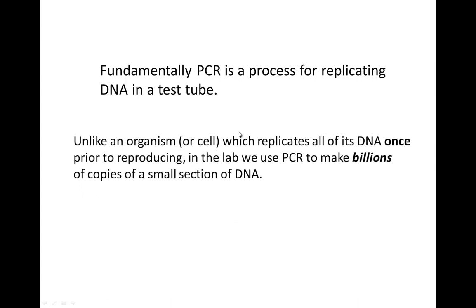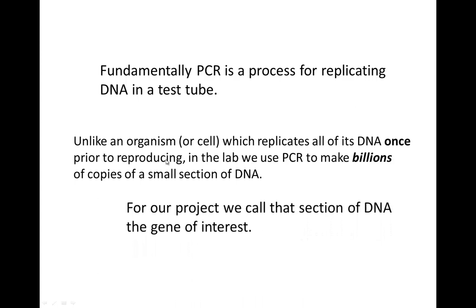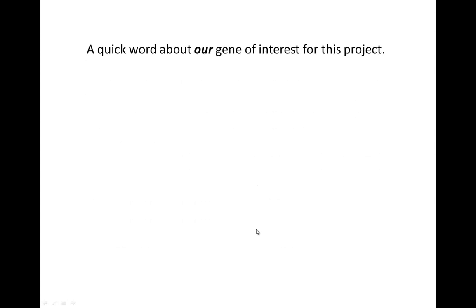So unlike a normal organism or cell that replicates all of its DNA just once prior to reproducing, in the lab we use PCR to make billions of copies of just one small section of that DNA. For our project, we call that section of DNA the gene of interest. So now a word about our gene of interest.